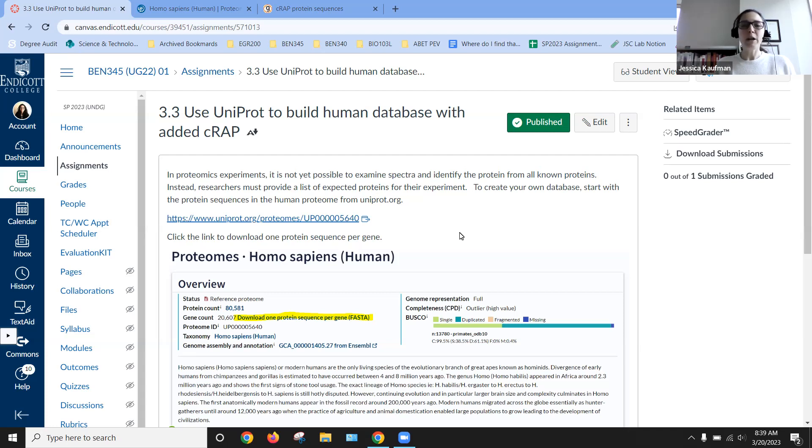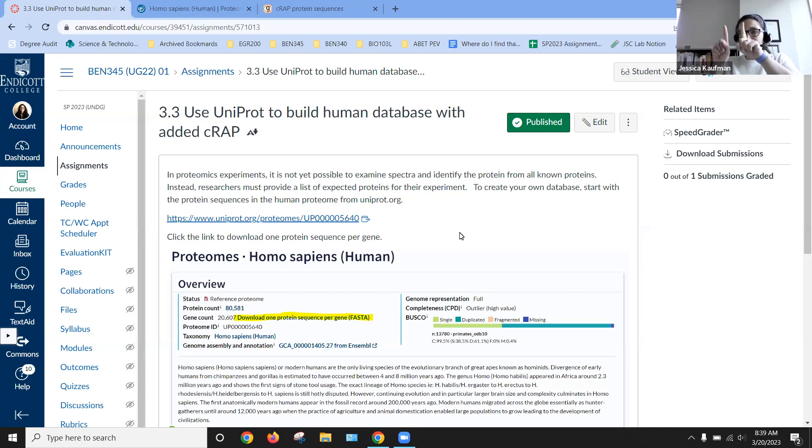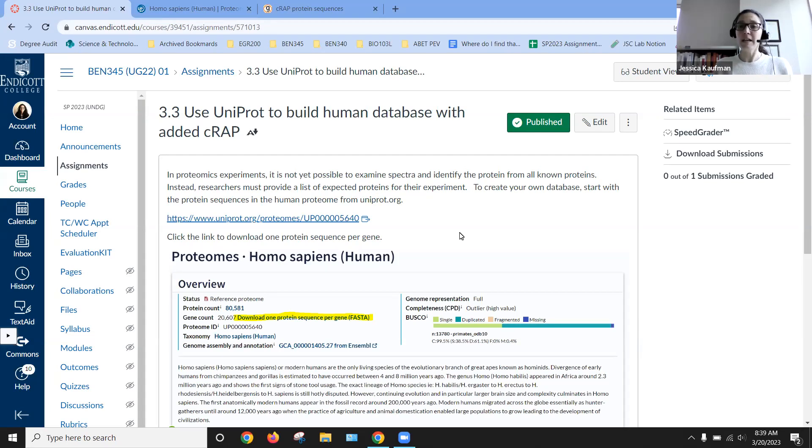But we don't yet have the ability to look at those spikes, look at the different peaks that we get from a mass spec experiment and determine what types of proteins are in the sample.